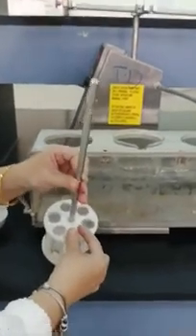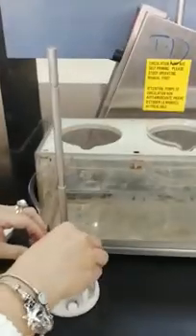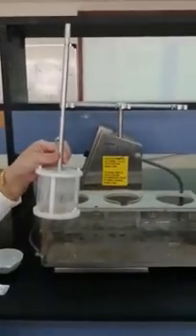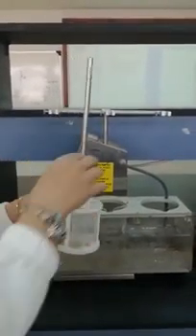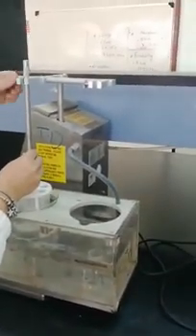We put it in the 6th cylinder and cover it in order to prevent the tablet from floating upward. Okay, put it in the holder, and the device started.